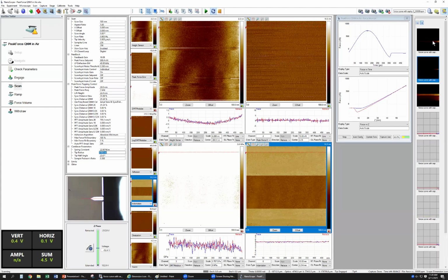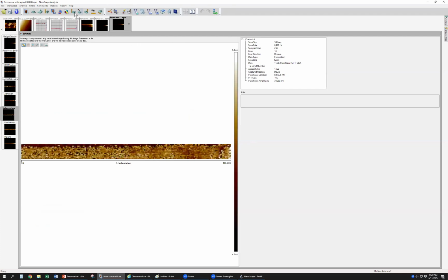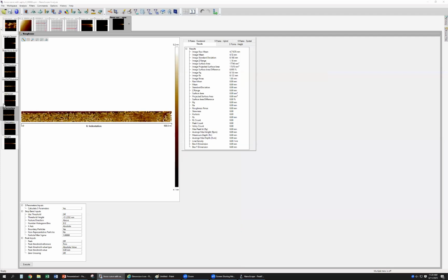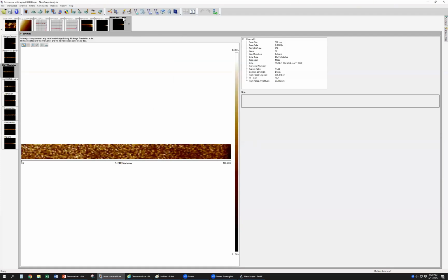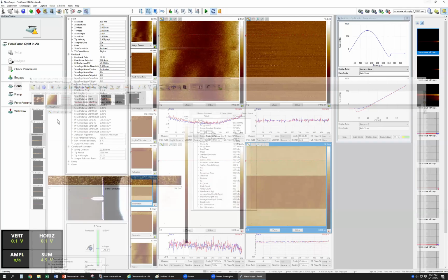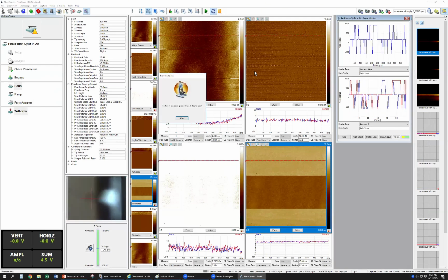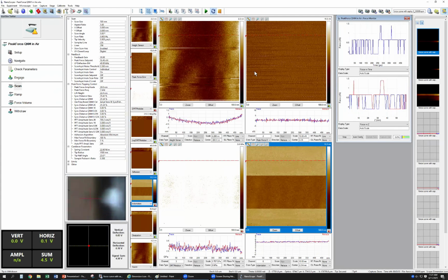So you get the capture now, and we see the indentation depth. Indentation depth. So the roughness is 4.7. Then modulus. Modulus is around 2.8. Is almost right. So this is all getting the reference. So after you get this one, you can change to what you want to measure. Okay. So this is the standard. And this is standard. This is inside this box.